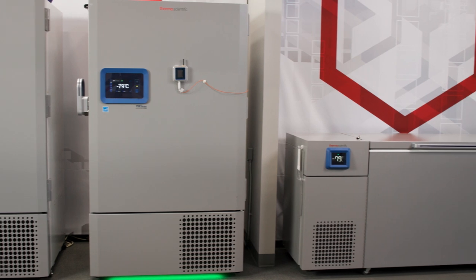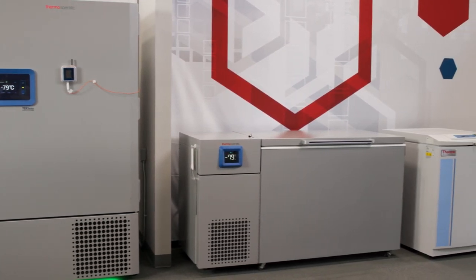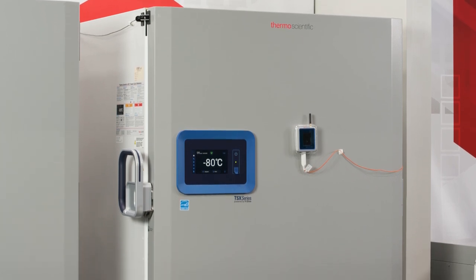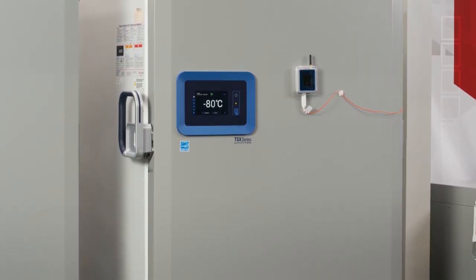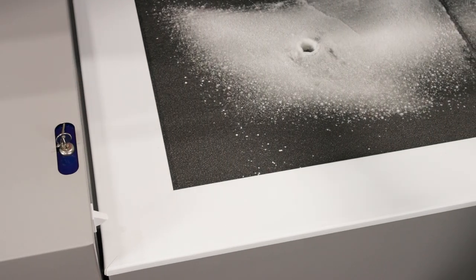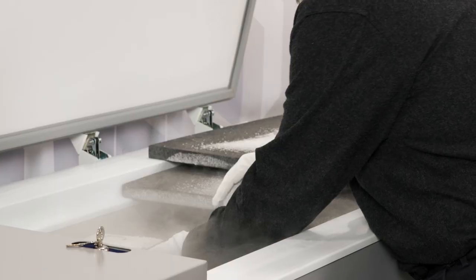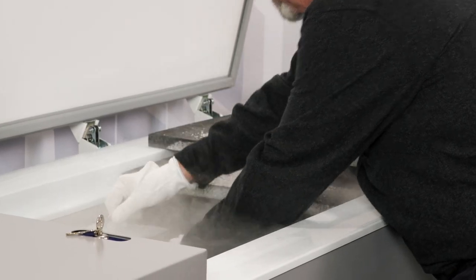When you're looking for a new freezer, you'll have to decide whether to buy an upright or chest model. In this video, we'll talk more about that decision and what you'll need to consider, such as footprint and overall size of the freezer, and how you plan to store your samples, and the freezer's temperature recovery time. All important aspects of choosing your freezer type.